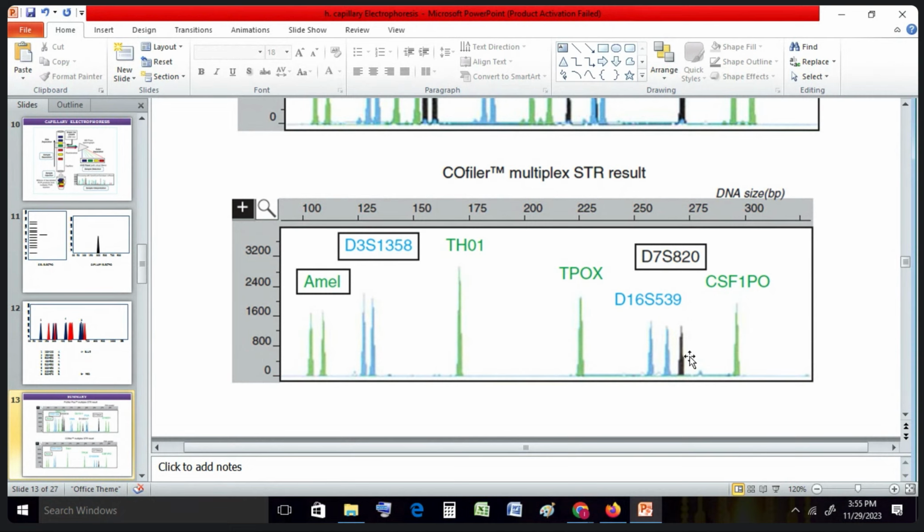Did you understand the question? This peak is long, this peak is short, this is also short. This is kind of in between, a medium-size peak or medium-long peak. It is also medium long. These are short peaks. Why are there these differences? What does it indicate?